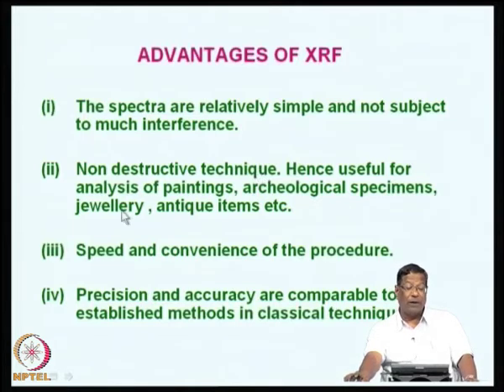Therefore, it is useful for the analysis of paintings, important paints, and archaeological specimens. You can analyze jewelry, antique items, etc. And then speed and convenience of the procedure is also one of the important advantages of XRF, and then precision and accuracy are comparable to established methods in classical techniques.